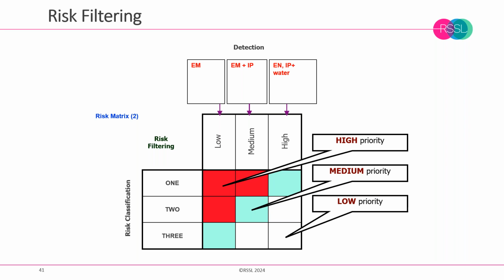So we go from one risk filter and then use the information from that to go to our second risk filter. And then what we can also do is transpose on these outcomes the monitoring frequencies that we were looking at.